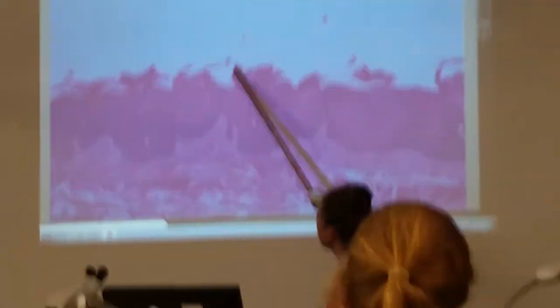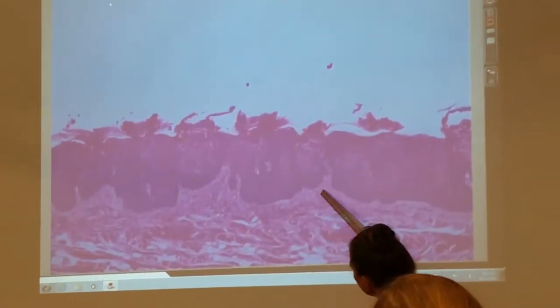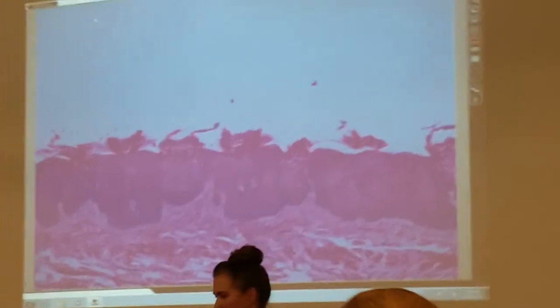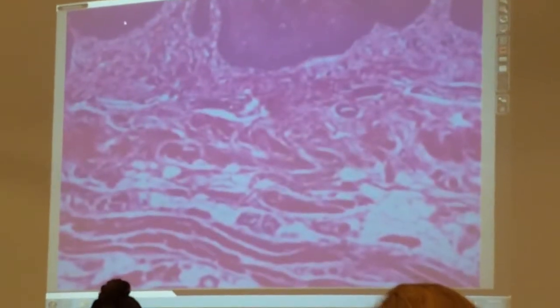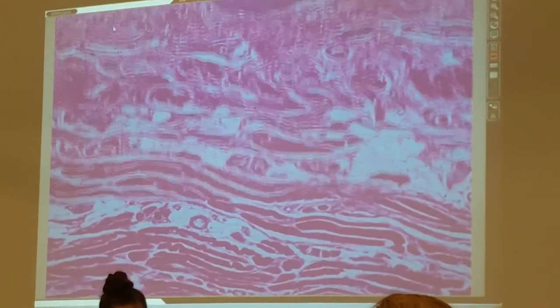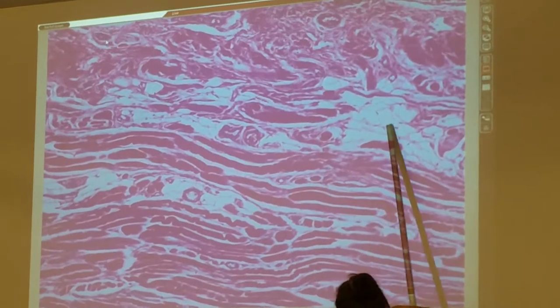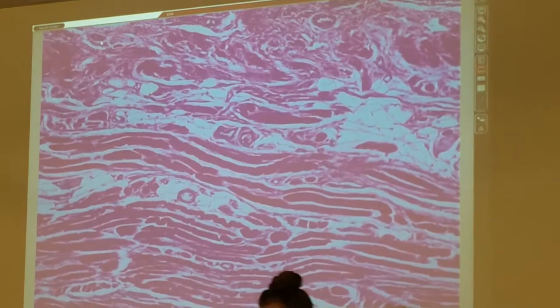The pointy structures you see here are filiform papilla. What is this material here? Lamina propria. And if I went up to a little bit higher magnification, we can look right in here. You can still see everything fairly well. What is this tissue here? Skeletal muscle.